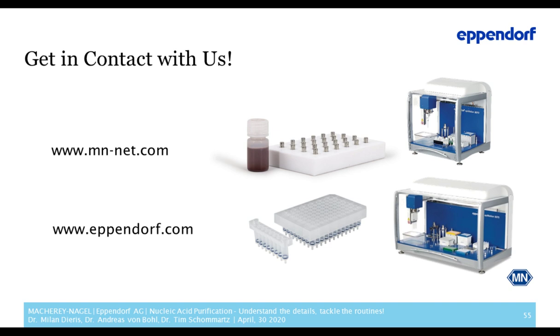It's actually a question that we get a lot, because if you're doing nucleic acid purification manually, I would guess most of you are doing that with the small spin columns. If you switch to automation, I have to say that most of the time you cannot hold on to your spin columns, but you can usually hold on to the same chemistry and the same process. So in this scenario, the spin columns are replaced by a plate format. It's simply a 96-well plate with the silica placed in this plate. So it's like 96 spin columns connected.